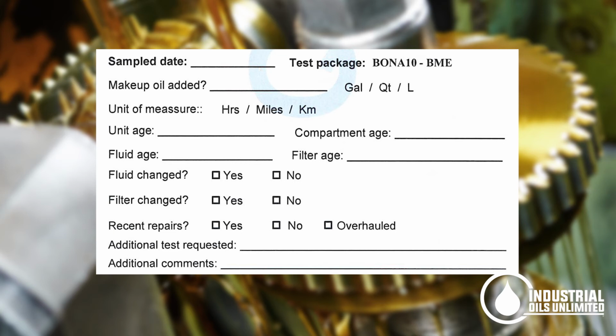On the next line, we are asked about makeup oil. If any makeup oil of any kind has been added, be sure to note that here. This can have an impact on how results are interpreted, particularly if we are trending analysis results over time, and makeup oil has been added at a certain point.